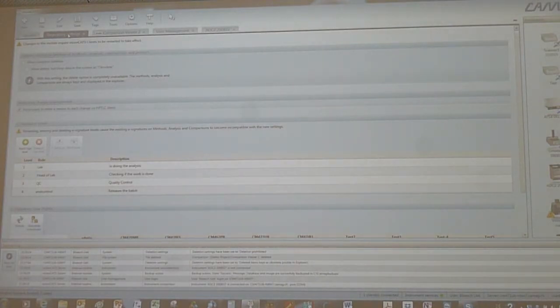But if the acceptance criterion is 5% and you wrote 7% and then you strike it through and write 5 or 4.7% or something, maybe you would have to explain why you did that, because otherwise they will see that it was just too much. So yeah, okay, this is forcing users to enter a reason.